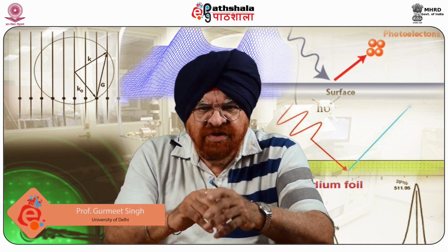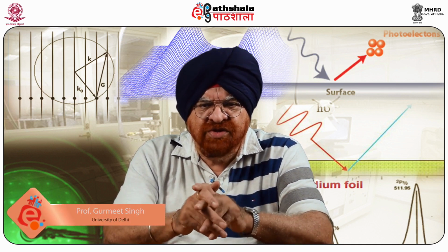The dipole scattering mode of this spectrometer is carried out in a specular geometry, where the electron incidence angle, which can be 60 degrees to the normal of the sample surface, is equal to the electron scattering angle. I hope one would be able to appreciate the potential of this spectrometer in terms of surface analysis.